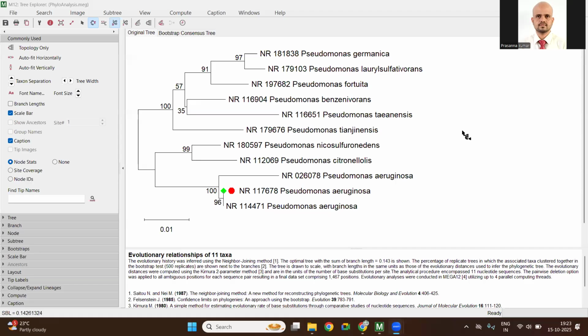Hey, welcome to Notes, and today we are going to see how to interpret a phylogram. We have a series of lectures to show you how to draw a phylogram using BLAST analysis, reference sequences, multiple sequence alignment, using MEGA to align again and draw this phylogram.